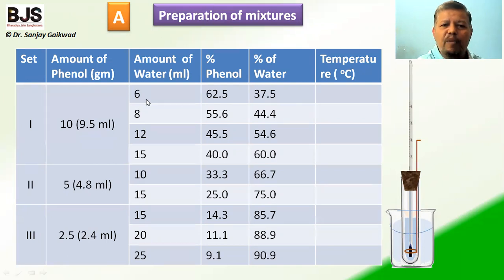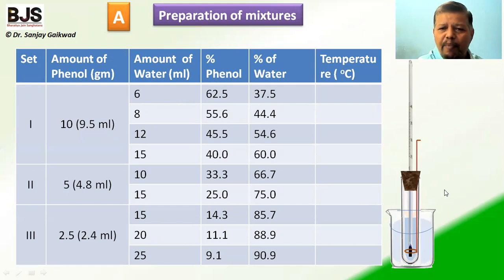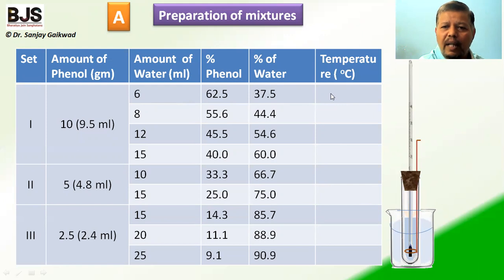Then we add 6 ml of water in that proportion. We keep this hard glass tube with the stirrer and thermometer and heat it in a water bath with constant stirring. At a certain temperature, the two solvents — phenol and water — get mixed together to give a clear solution. Then we measure and record the temperature.